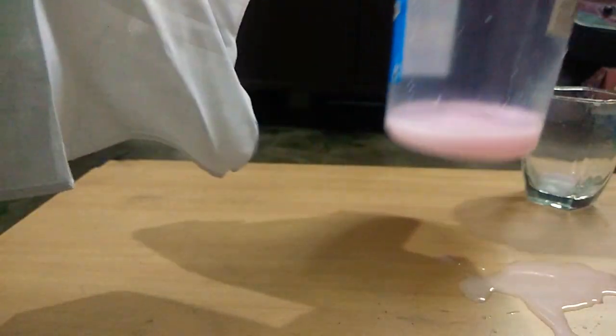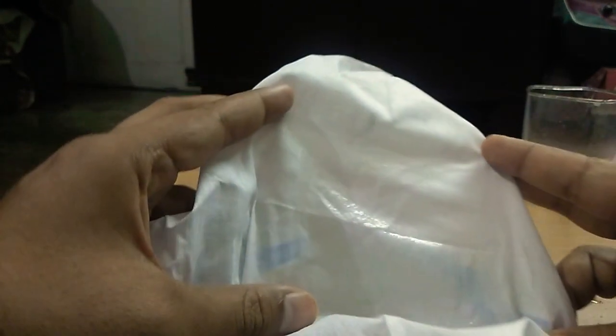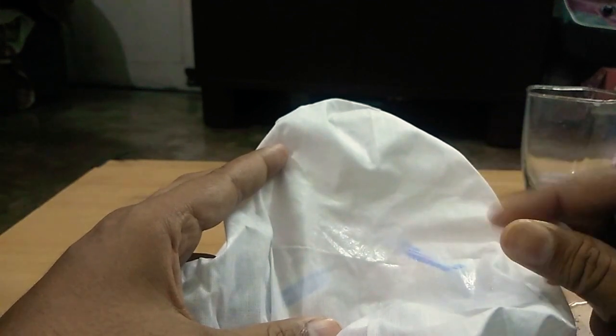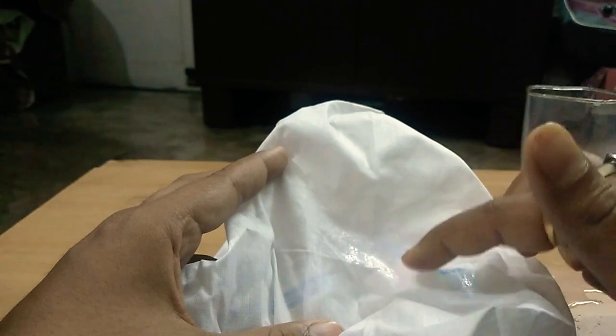In case of suspension, you find that the liquid part has come out, and in the cloth, if it is clearly visible to you, not sure because it is too white, there are actually pink suspended particles which have stuck to the cloth.